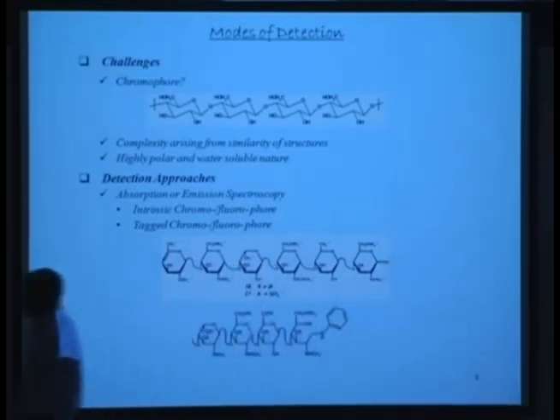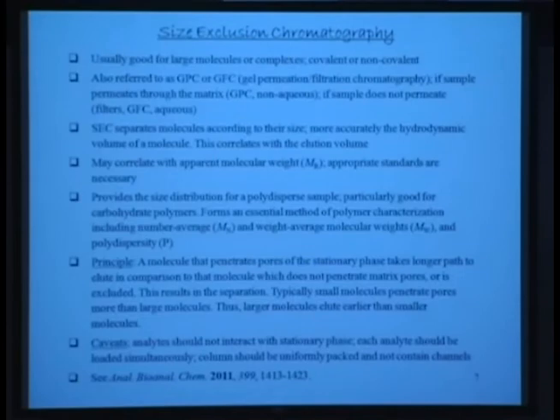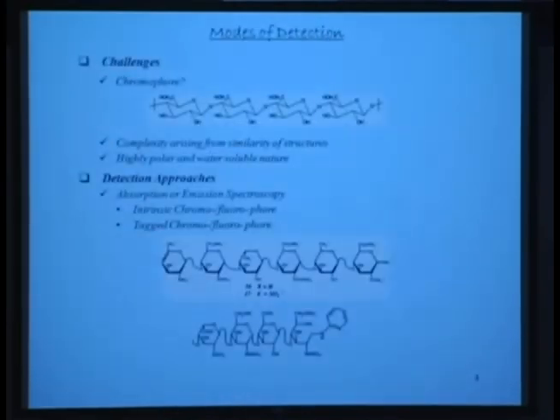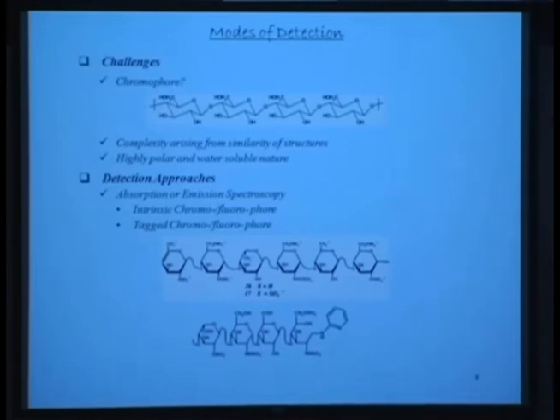Just to give you an example, let's see whether I have a listing. Okay, I don't have a listing, but there are close to 20 different amines that are reported with varying extinction coefficients. The commonest one is 2AP or 2AB or AMAC. Are we doing an experiment on this today? Yeah. So 2AP is basically 2-aminopyridine, and AMAC is aminoacridone.